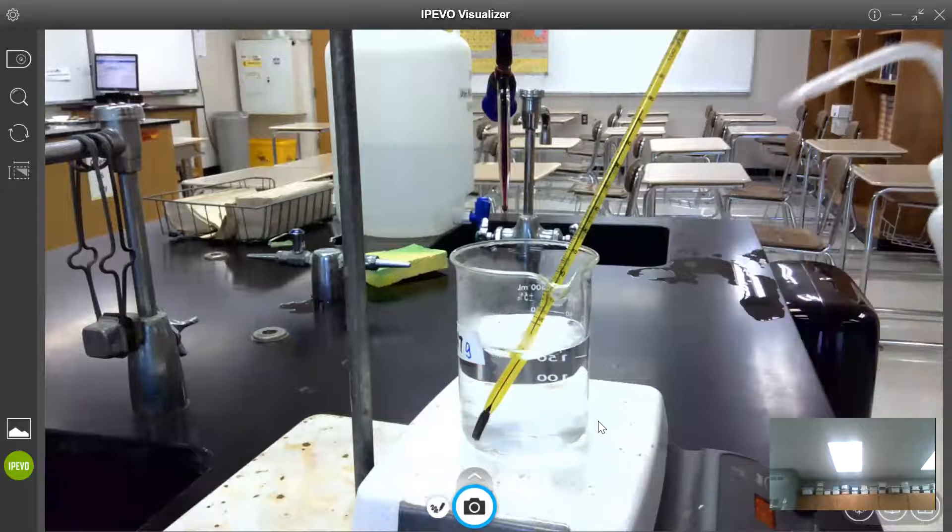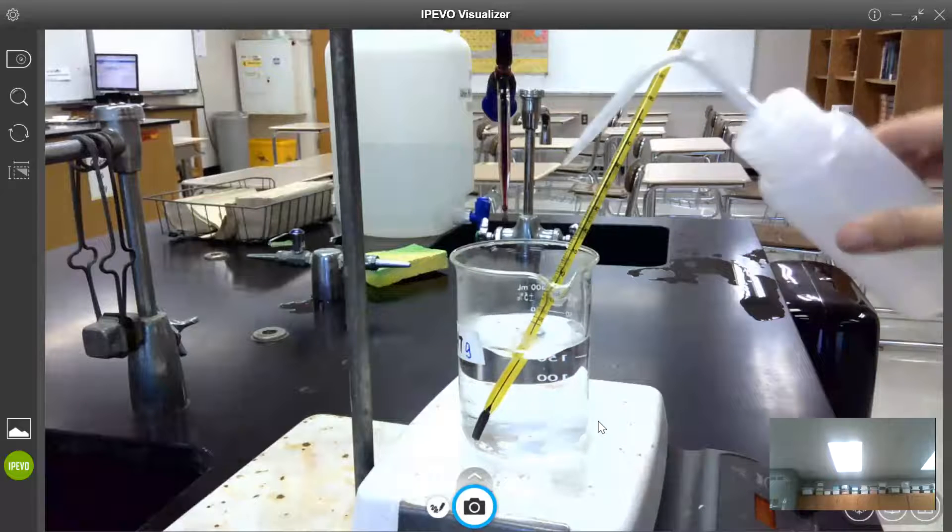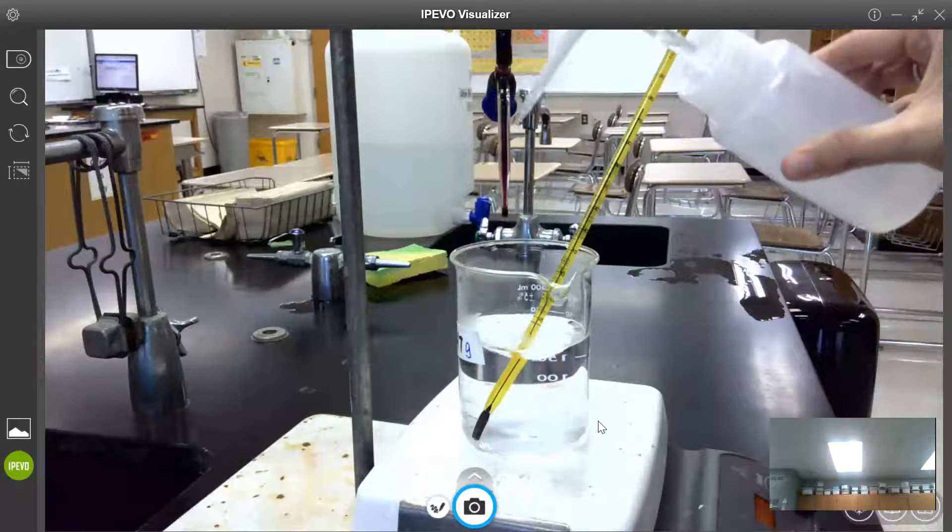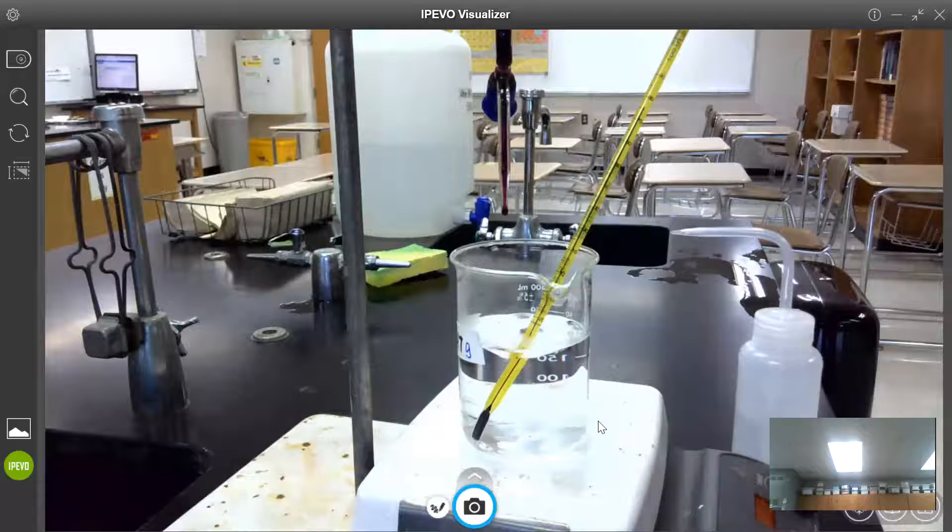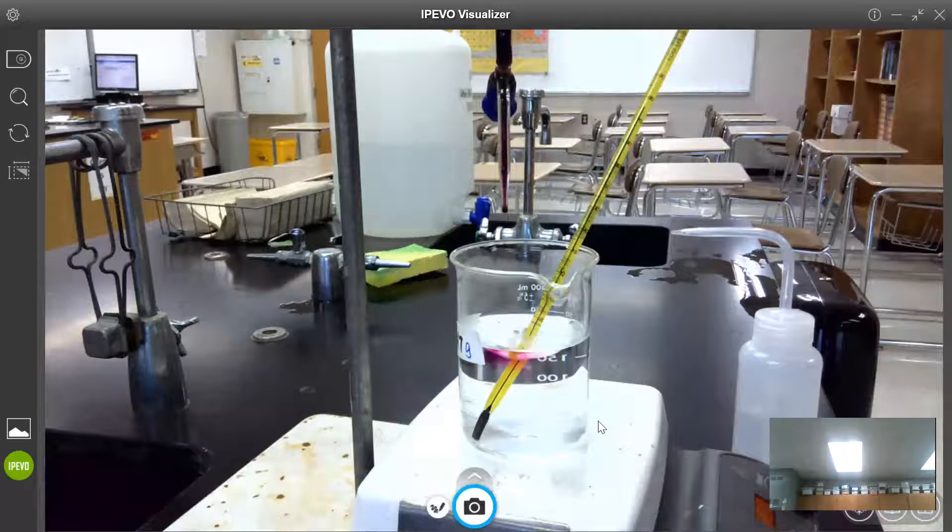You saw me add a little bit of water in this process. Whenever you're titrating it's always okay to add a little bit of deionized water if you need to rinse things down and make sure that they get fully incorporated.